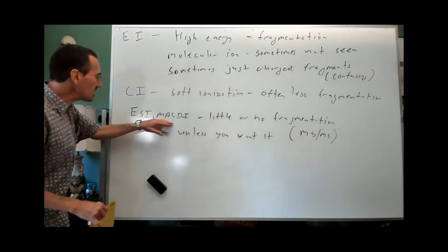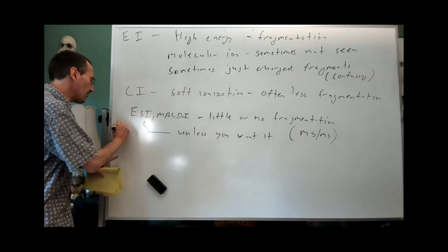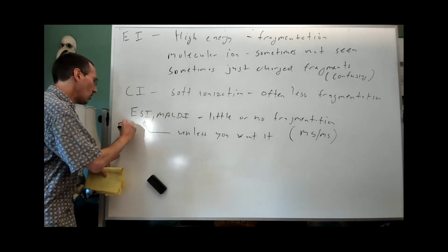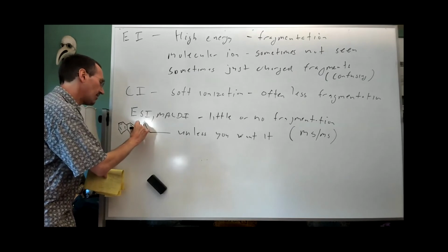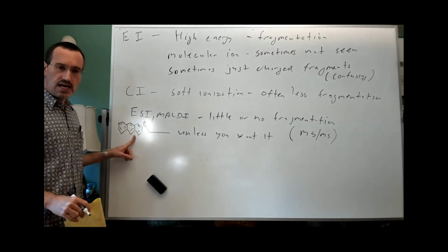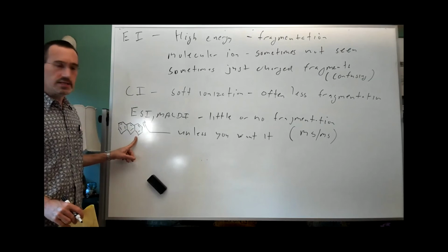So the cases where maybe these techniques wouldn't work so well is if you have a very big non-polar molecule with just no lone pairs of electrons. So for a molecule like anthracene, I'm not sure if you'd get a signal in ESI, or maybe you'd get a signal in MALDI, but it's harder to put a proton onto this.